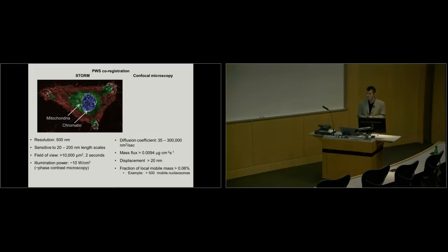something's not shown right here, but there was another image here. Trust me, as Donald Trump says, trust me, there's another image here. It's PWS co-registered with STORM and the imaging. There's a beautiful image, which is not projecting here, of the confocal microscopy.